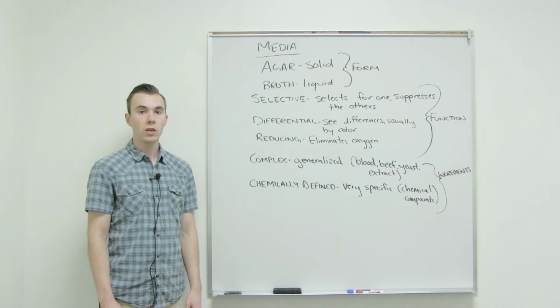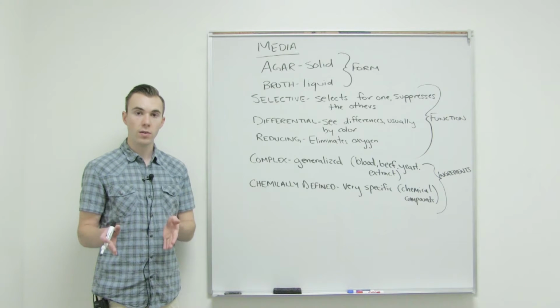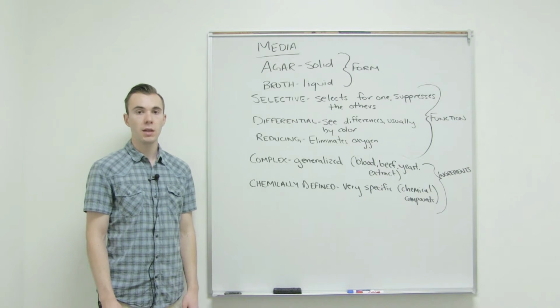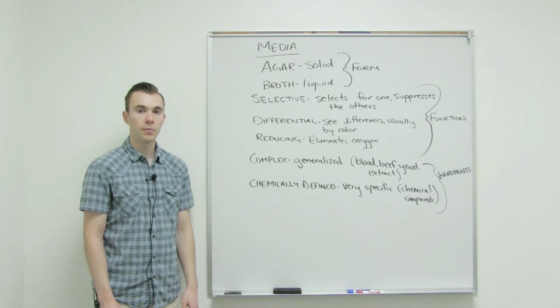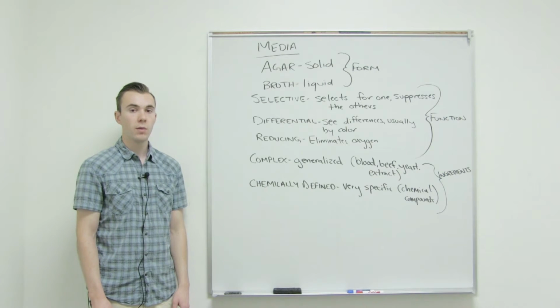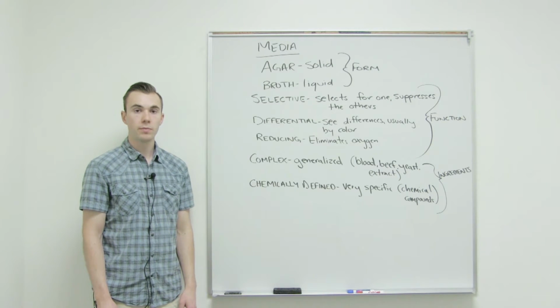So again, just make sure that you don't look at the ingredient amount, look at the ingredient itself, and then make sure that you remember that even if one thing is complex, the entire medium is complex. So these are the different aspects that are with media, with its form, its function, and its ingredients. I'm going to erase the board now, so if you have not completely written this down, I would recommend that you pause the video now and do so.